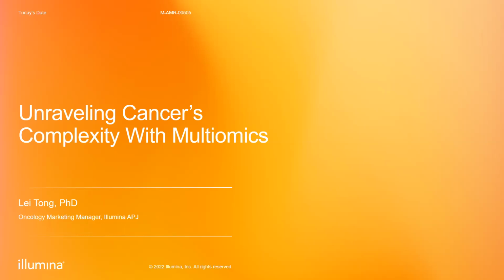After the two fantastic speakers sharing the exciting single cell analysis solutions from Mission Bio, I will be expanding the topic slightly with a brief overview of the multi-omics approaches in cancer research using next-generation sequencing technologies from Illumina, or NGS, and how those technologies have accelerated our understanding of cancer. NGS has also changed substantially over the last few decades to become this incredible, flexible platform that can help us thoroughly understand any level of cellular regulation and characterize the inherent complexity and heterogeneity of tumors.